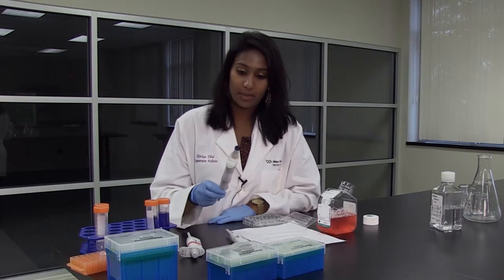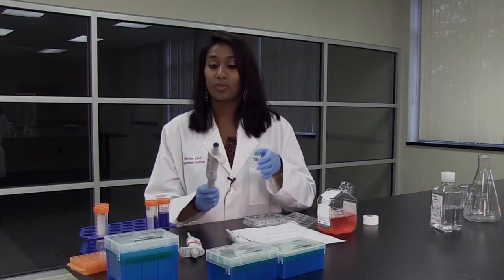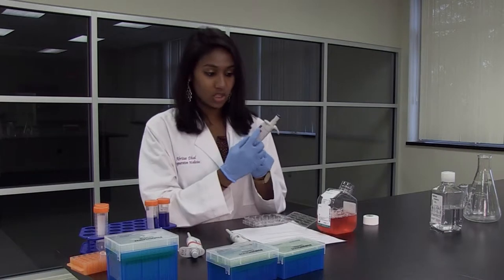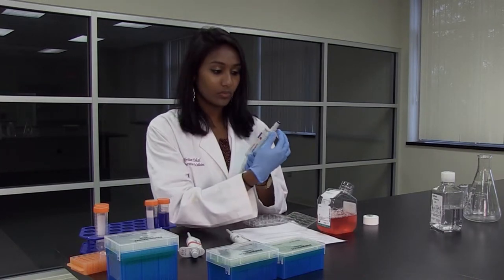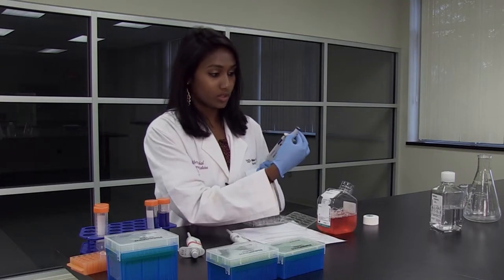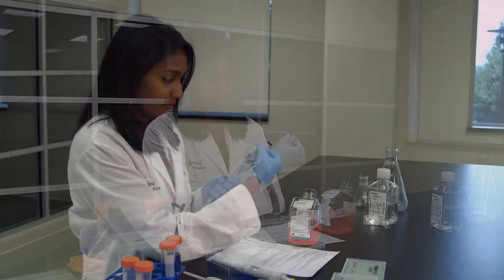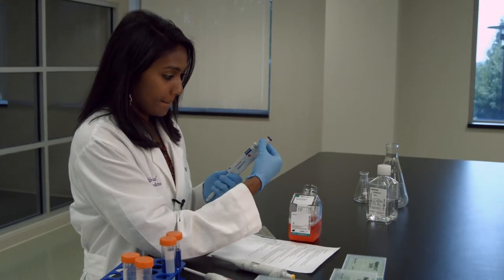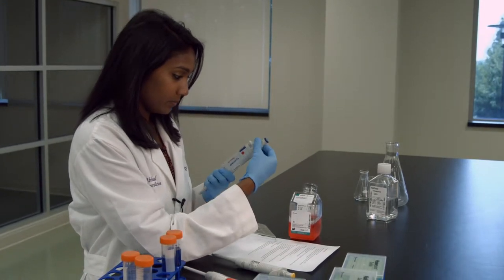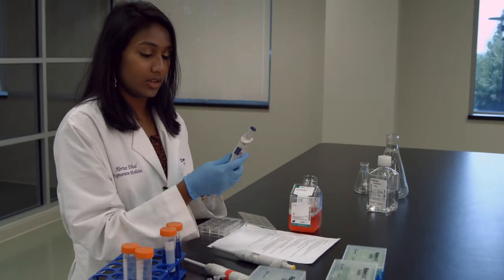A way to set the micropipette — with the P1000, this ranges from anywhere from 100 microliters to 1,000 microliters. We see these digits over here, and the way to set it: if we want to do 800 microliters, we twist the knob at the top to 800 microliters.